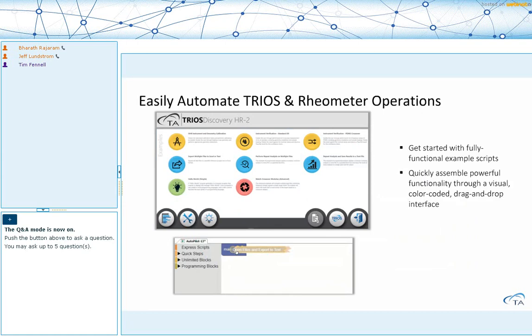And I'm also going to bring Jeff into this conversation because he has extensive experience with integrating with LIMS systems. Yeah, actually, we do have a lot of customers that have requested this very same thing, and in some cases they want the data formatted in specific ways to go out to the LIMS. Anything that you can put inside of your data file can be put into a text file via autopilot in any format.